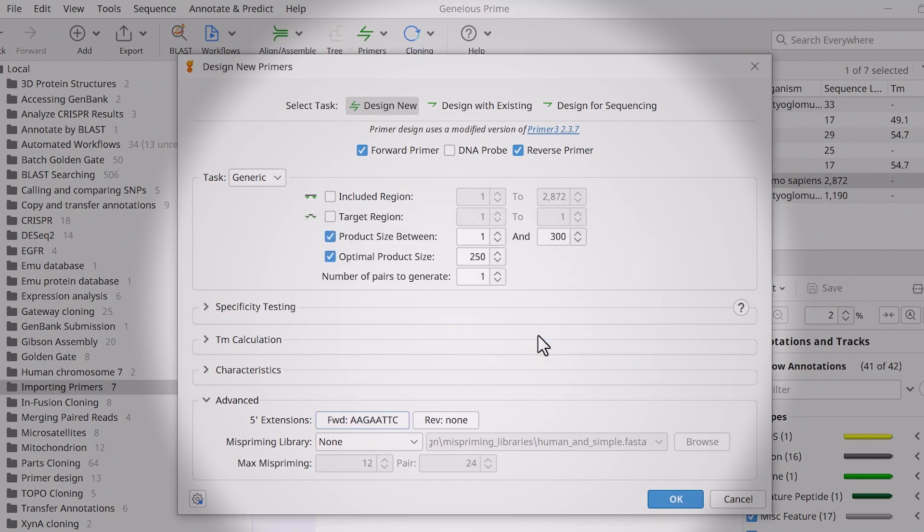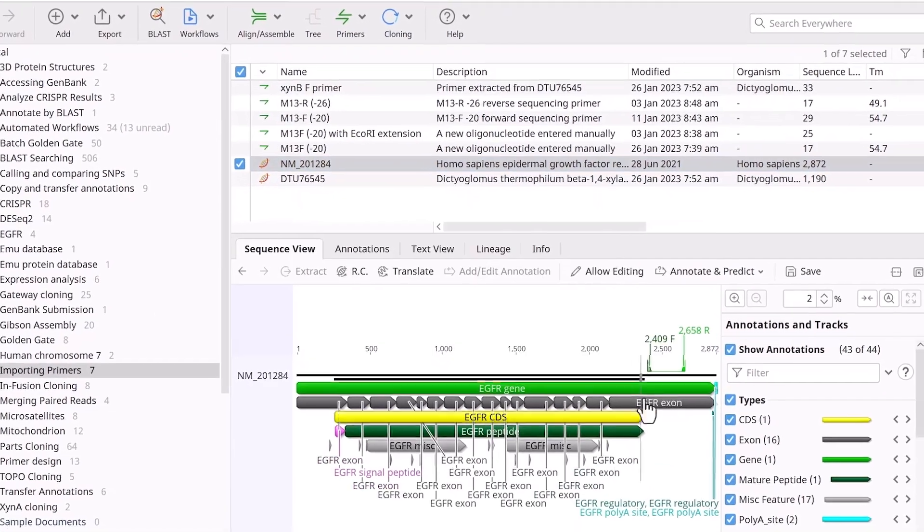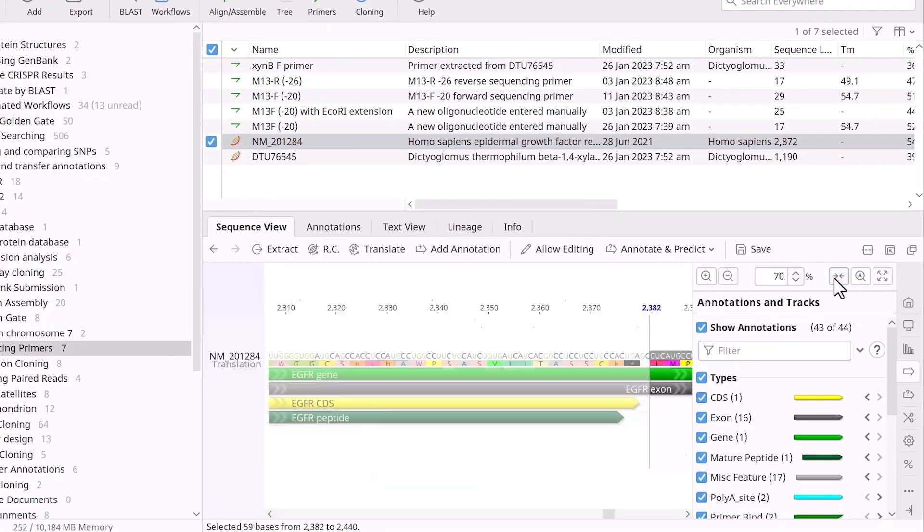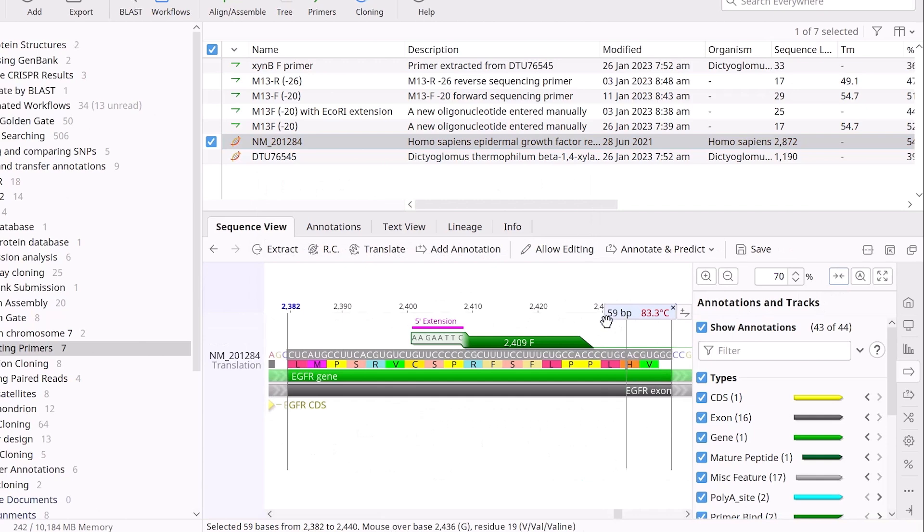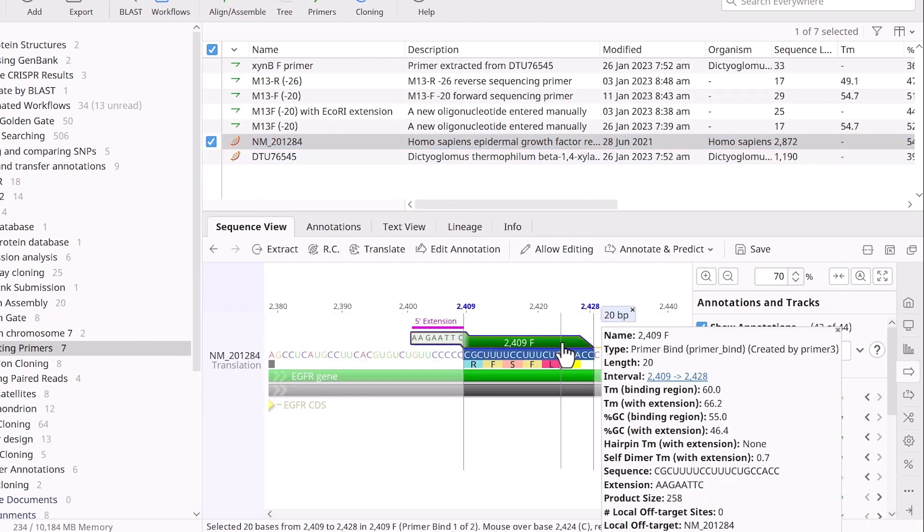Finally, click OK to design the primers. Once you have designed the primers, you can zoom in to view the sequence, including the five prime extension.